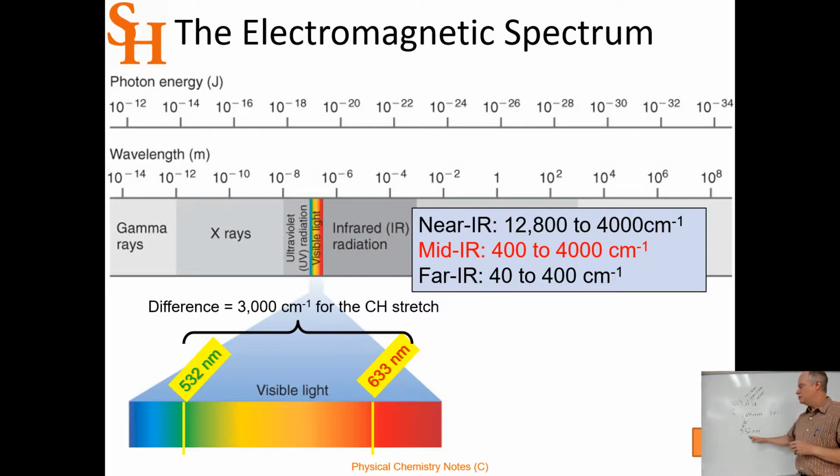This also gets you really into the mid-range of the visible light detectors. And so all of our CCD cameras and technology that we've made for photography can be used now to do spectroscopy. And so that's come down in price, because if you think of all the cameras that you have on your phones and everything, that technology is mature and cheap.